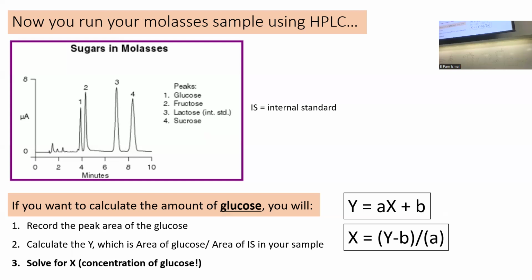You only have a regular absorption detector. So you don't know which one is caffeine. In the sample, you add a standard to the sample. Then the caffeine peak will increase in size. It's different than spiking with an internal standard. But you can spike with the actual component to know where it is if the detector is not strong.